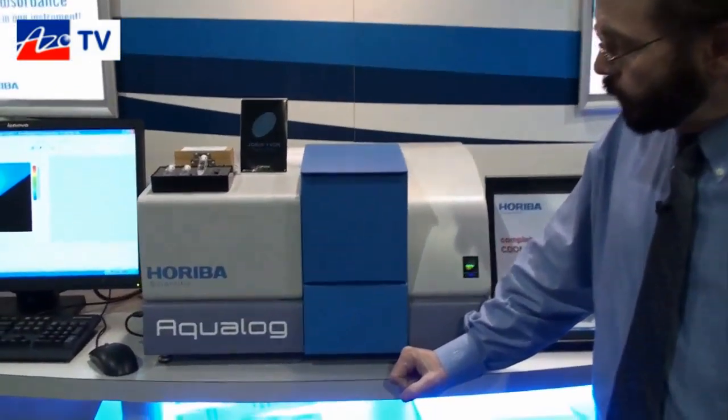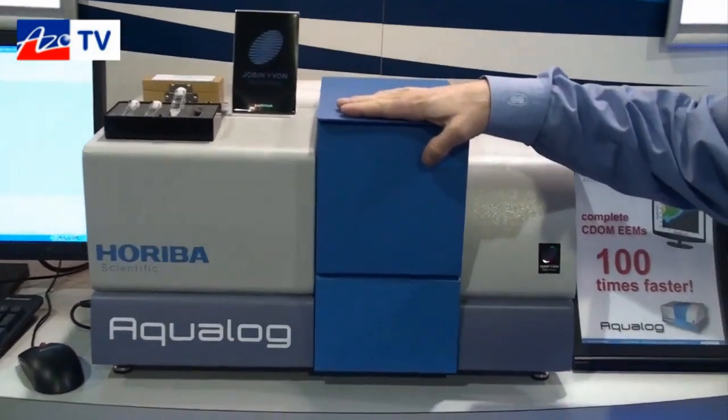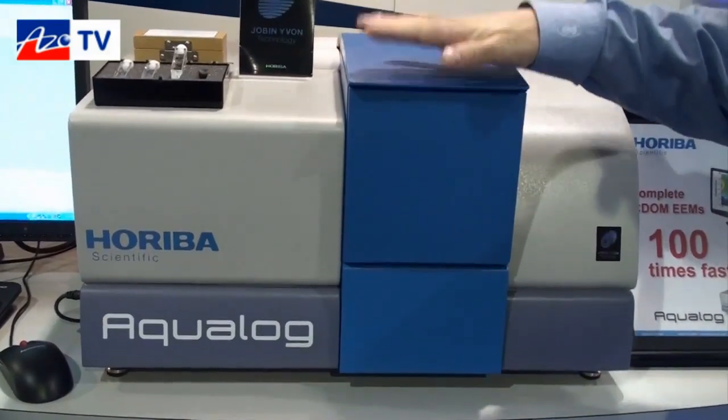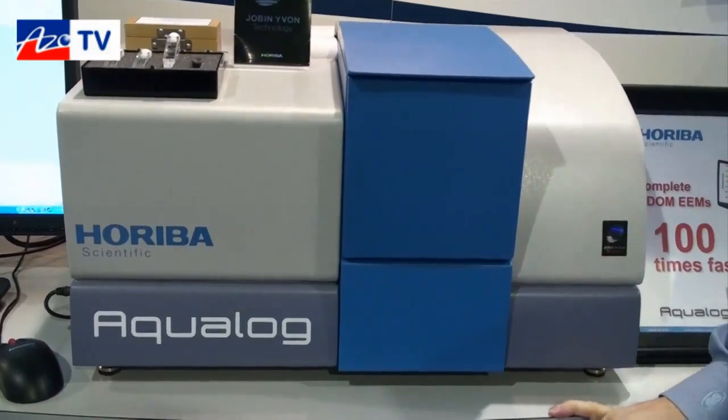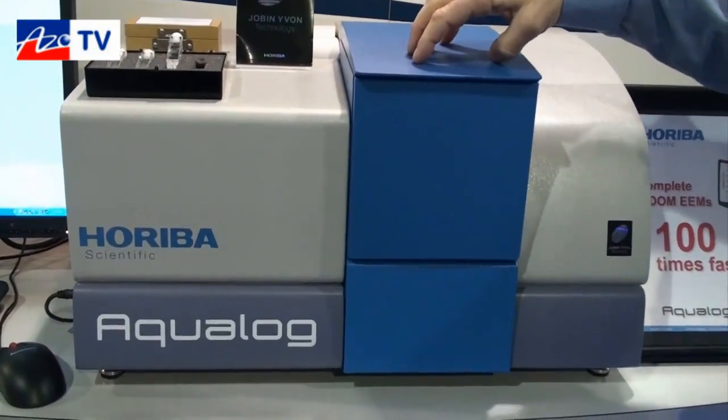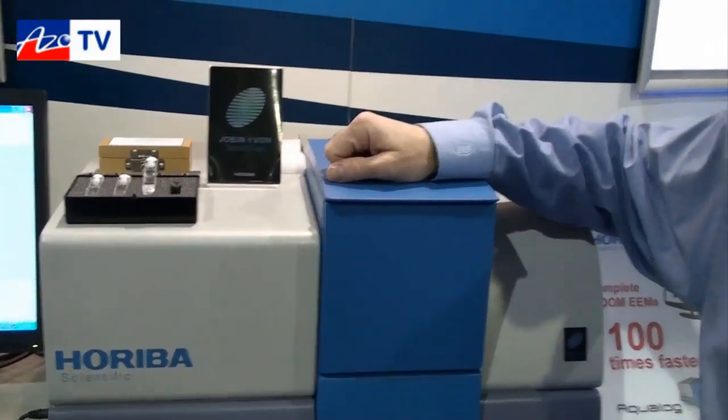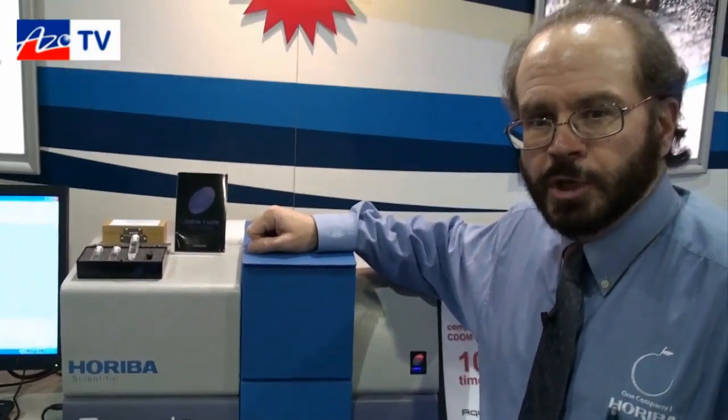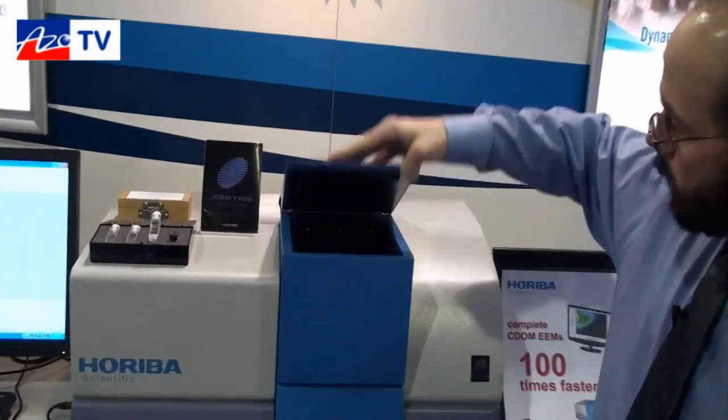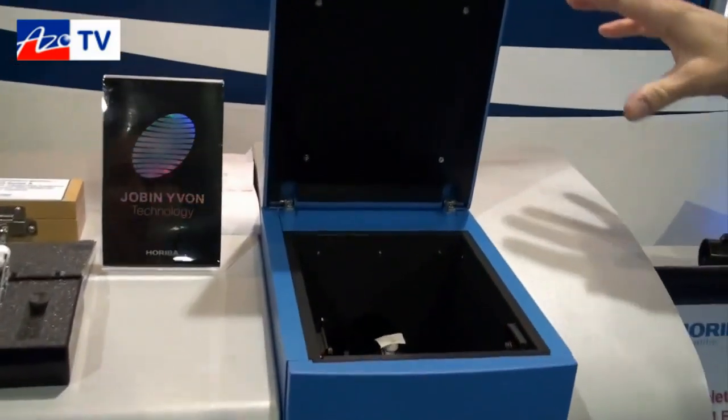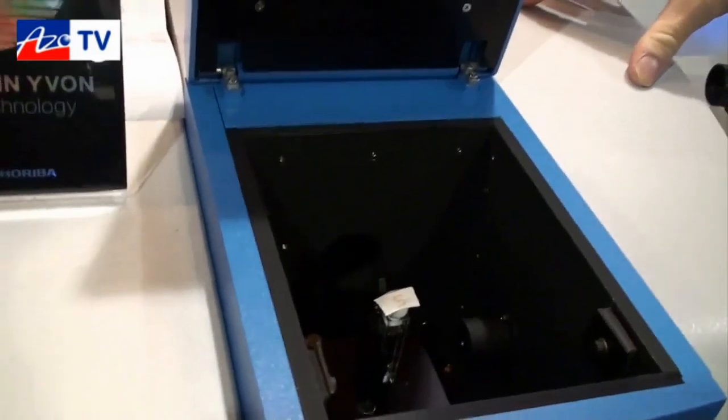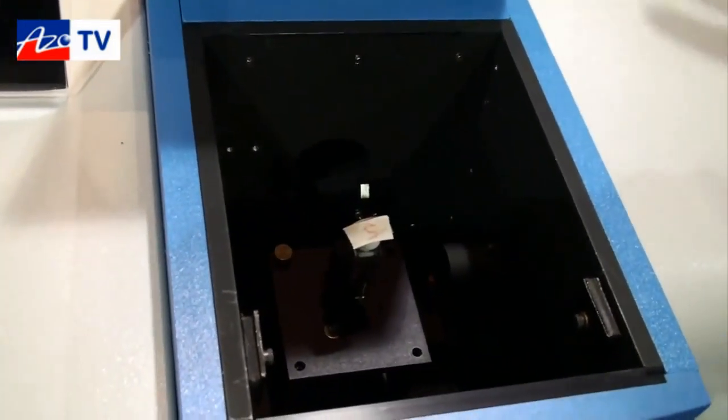Good afternoon ladies and gentlemen, this is our new Aqualog. It's a first-to-market release, a brand new system. It's the first system on the market that will do a true simultaneous absorbance spectrum and fluorescence excitation emission map. It's also the first system that uses a CCD as the fluorescence emission detector, so it's a hundred times faster than any other fluorescence system on the market.